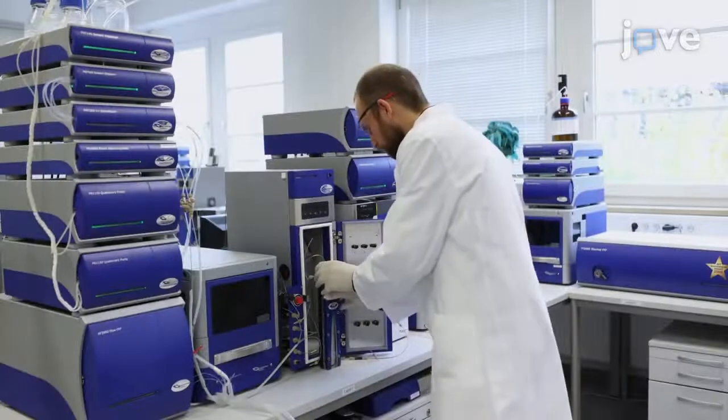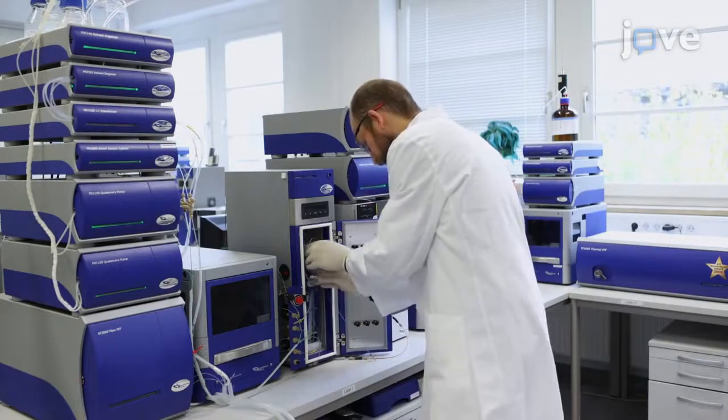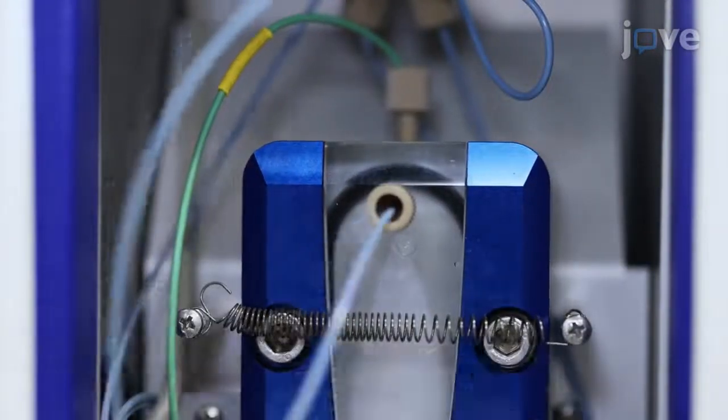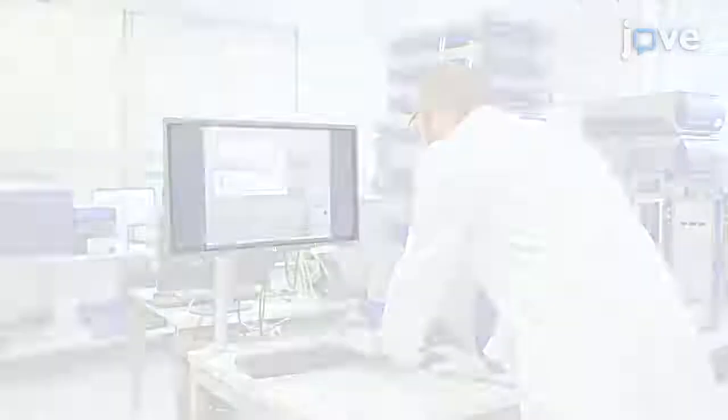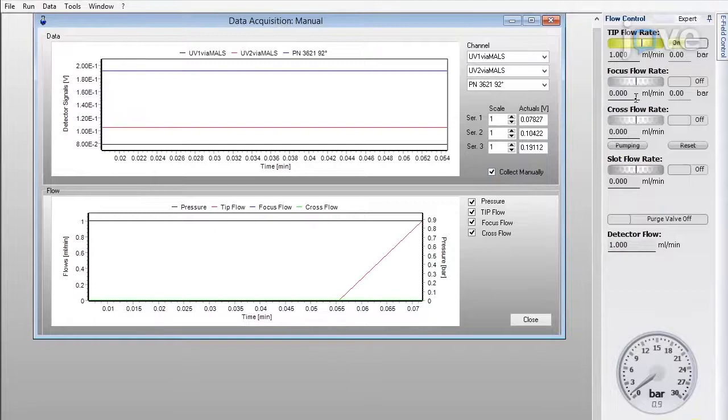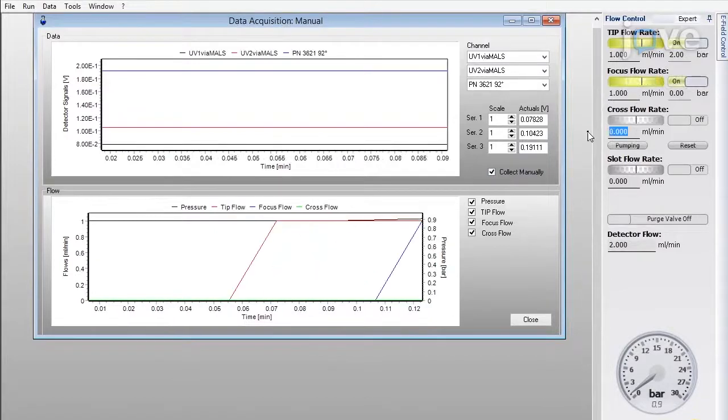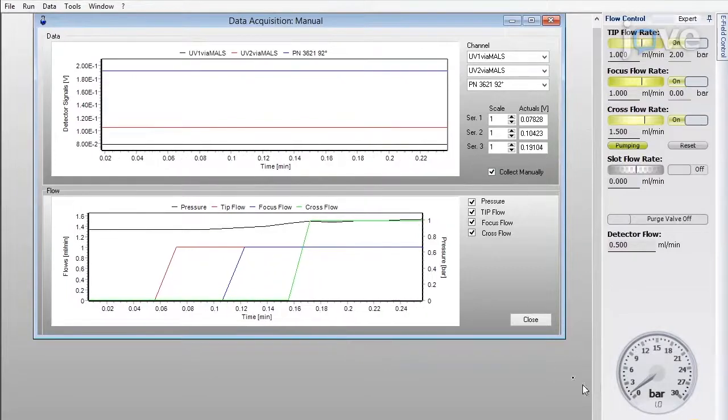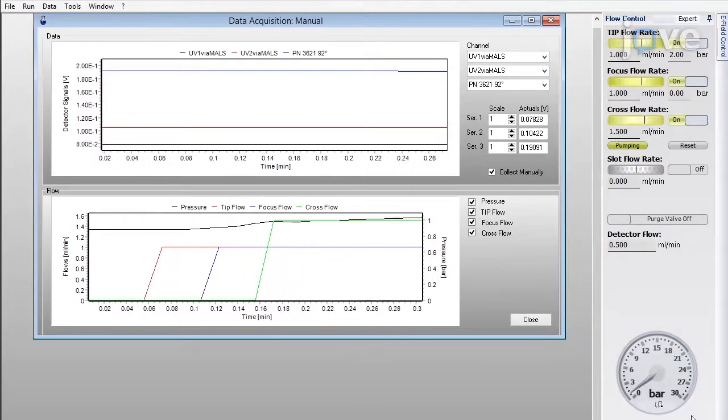Then reconnect the cartridge to the AF4 UV-Vis system. Flush the cleaned system with filtered and degassed eluent for at least 30 minutes by applying a tip flow rate of 1 milliliter per minute, a focus flow rate of 1 milliliter per minute, and a cross flow rate of 1.5 milliliters per minute to equilibrate the membrane, stabilize the system, and check for potential leaks.